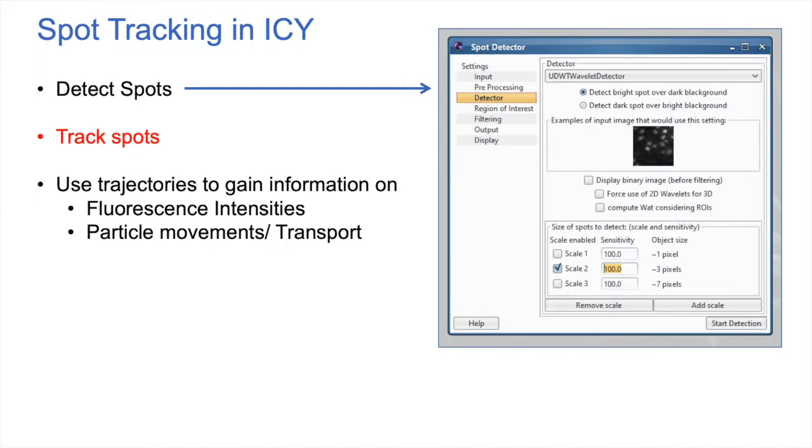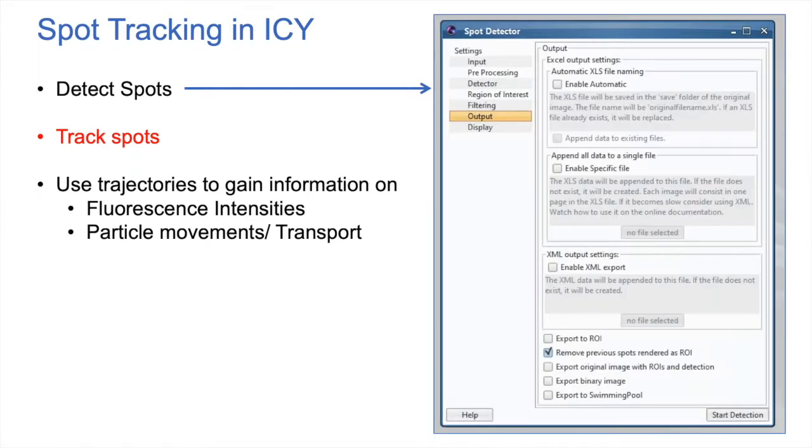I think I gave you guys a protocol which works very well. So the protocol that I've given you will say use this at 80% and that at 100%. So when you combine these scales, it will help separate 2 objects that are too close to each other. Okay, so that way you don't look at 2 objects as one. All right, so these are nice functions on this.